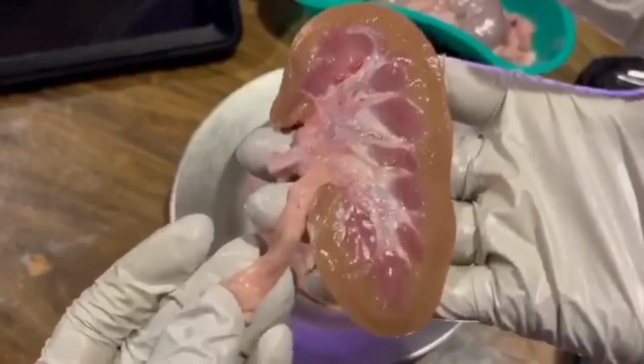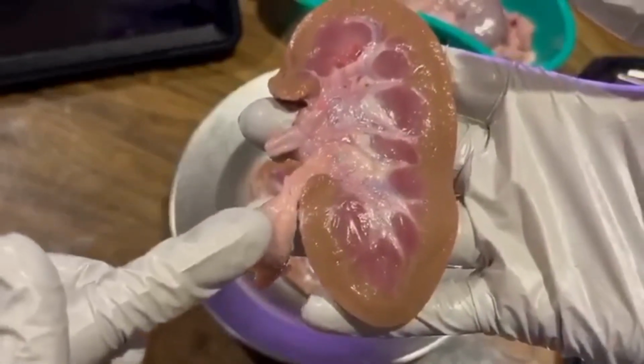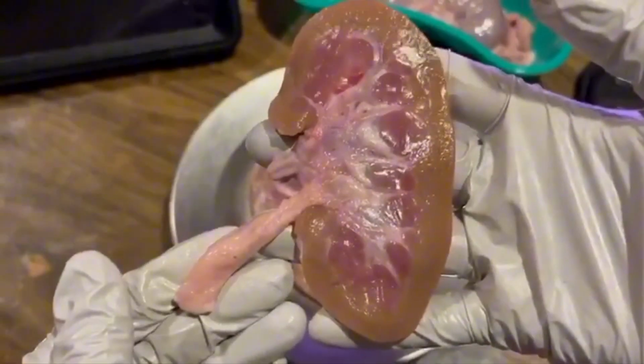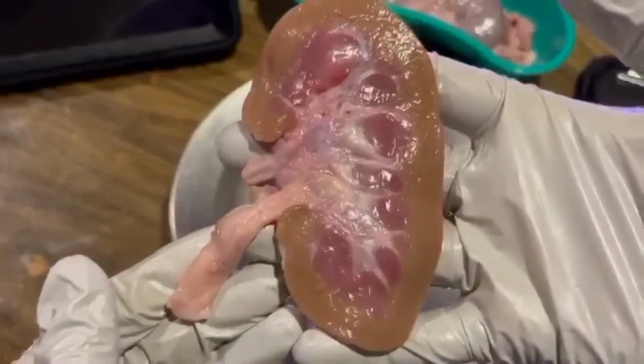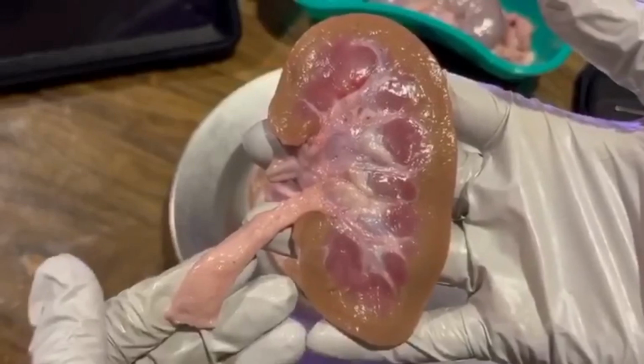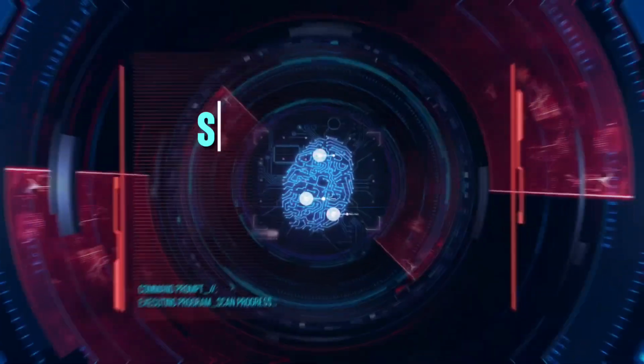It's often located near the bladder, and if you can find the bladder, you can trace the ureter back from the kidney. The ureter is responsible for transporting urine from the kidney to the bladder for storage. This process involves smooth muscle contractions that rhythmically propel the urine downwards.